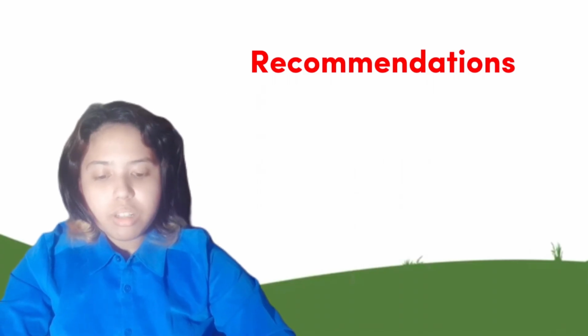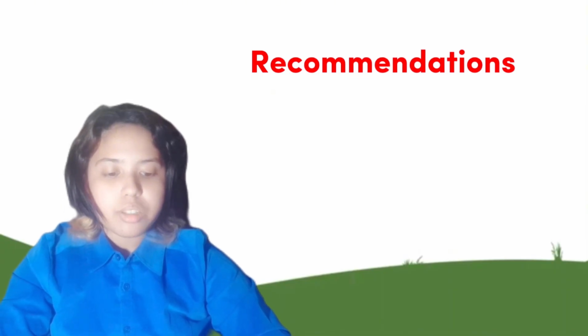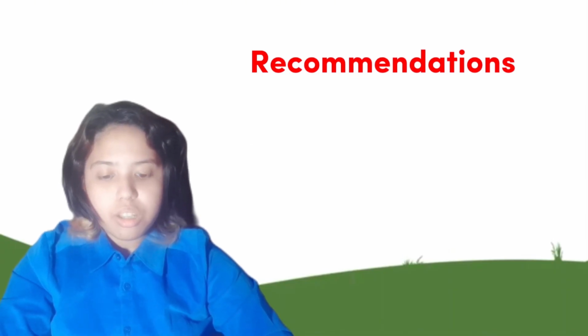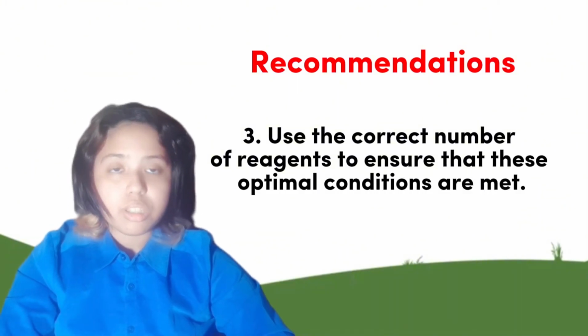Lastly, chemical reactions often require specific ratios of reactants to proceed efficiently. Using the correct amount of reagents ensures that these optimal conditions are met.